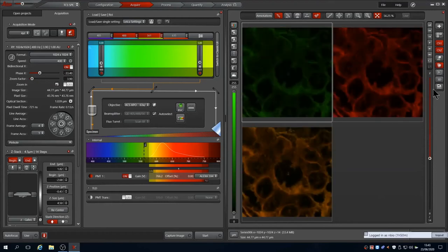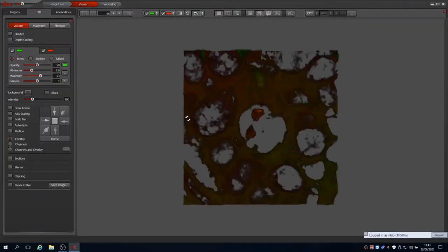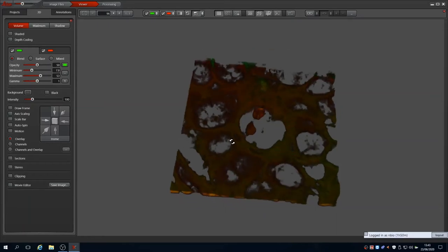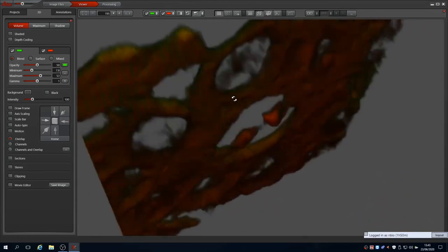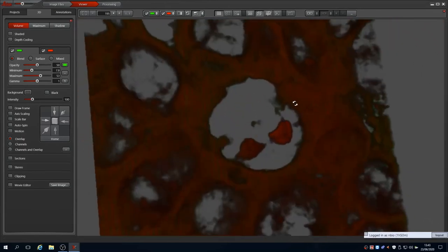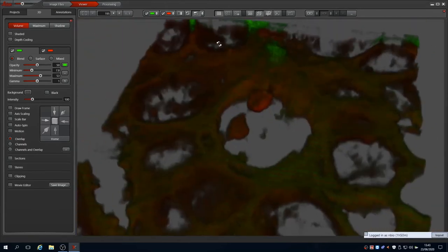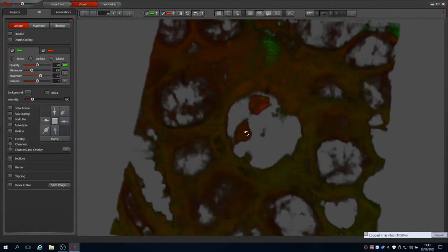The image can also be rendered by clicking the 3D button. This opens a new window for the renderer. This software makes a guess at the settings for minimum and maximum for each channel, and shows a volume render by default. The renderer is fully interactive using the mouse buttons. The snapshot window can be saved to the current image project file, or exported in various formats and resolutions.